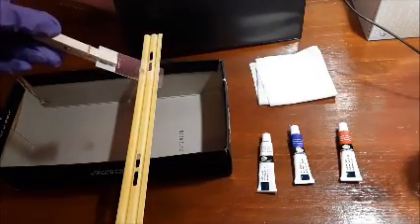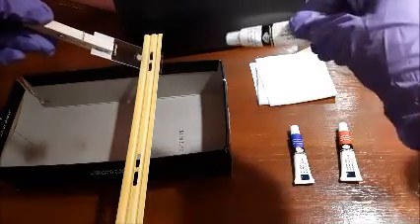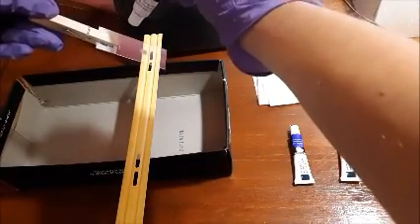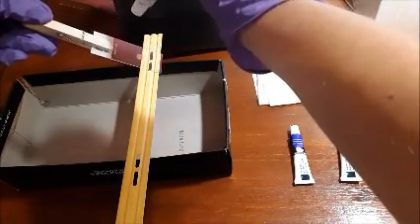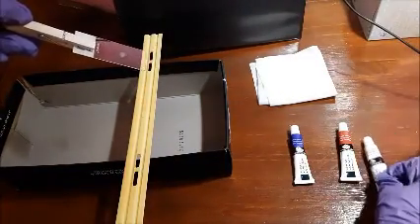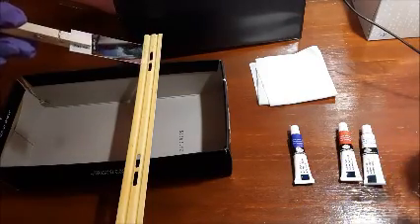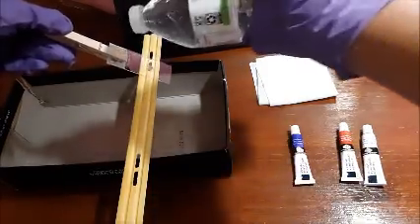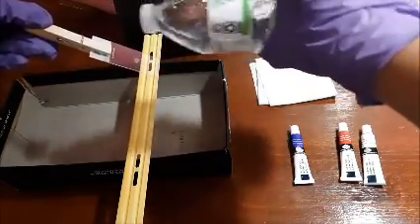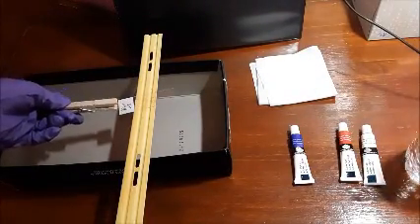Now don't put your slide down, because what you're going to do now is apply your acid alcohol. Remember, this is your decolorizer. You're going to apply about 10 to 15 drops of this to your slide. I'm just going to speed the process up. But once you're done applying the acid alcohol, you're going to rinse your slide down again with water to get the excess acid alcohol off, and then put the slide back down on the stain tray.